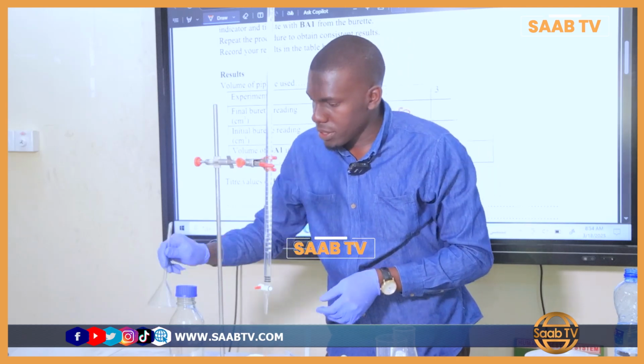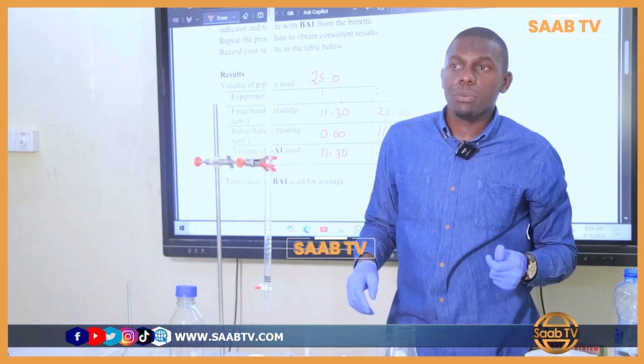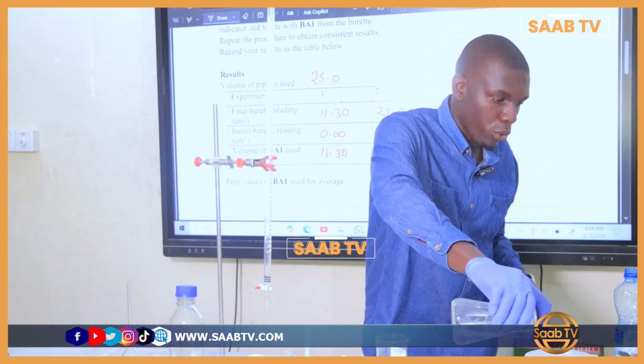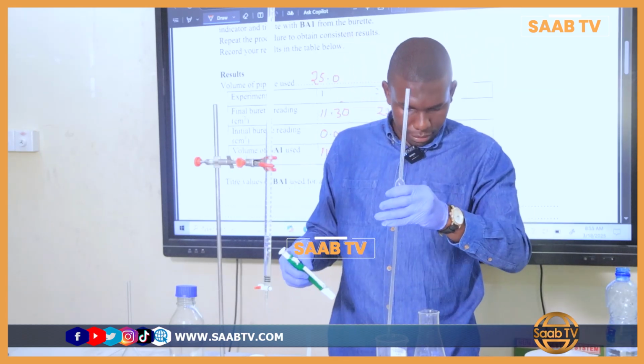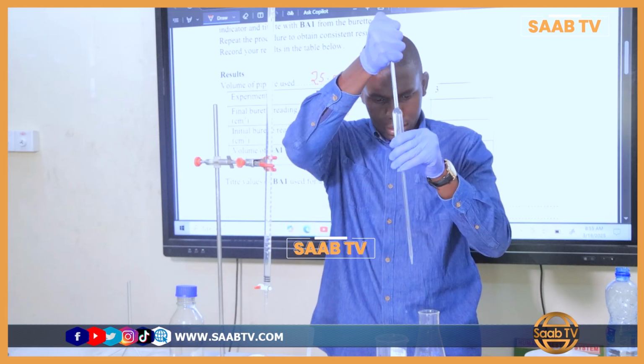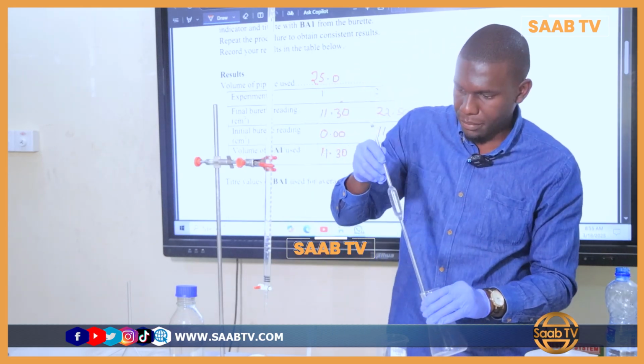Now we are going to repeat the third time. The purpose of repeating the experiment is to get concordant results. So we pour this one away, we wash with some water, we repeat again. Are we observing? So that is 25. Put in a conical flask.